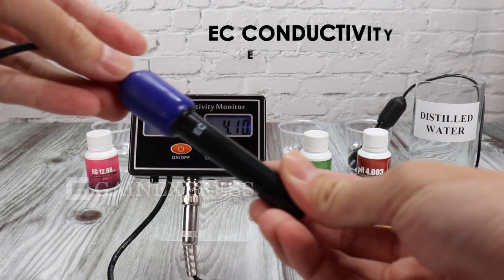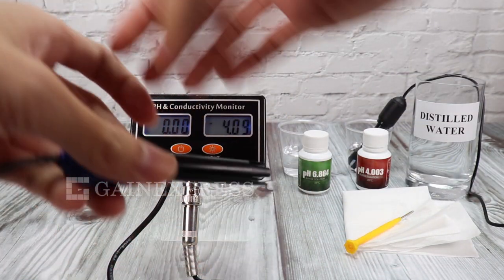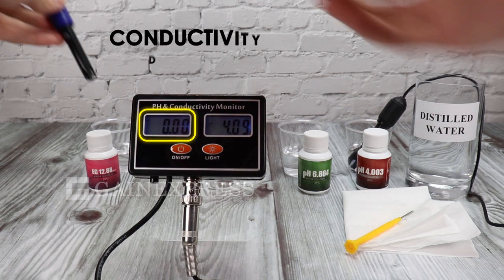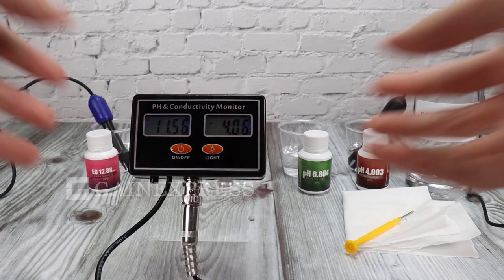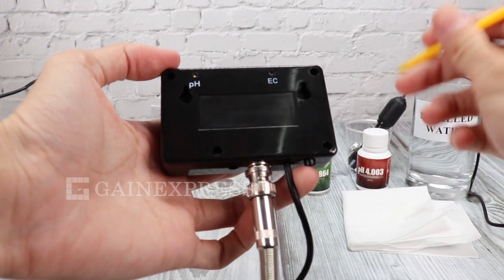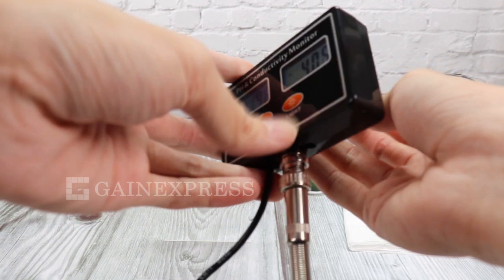For the EC electrode, immerse it into the EC 12.88 solution. Slowly turn the conductivity calibration trimmer until the display shows 12.88.